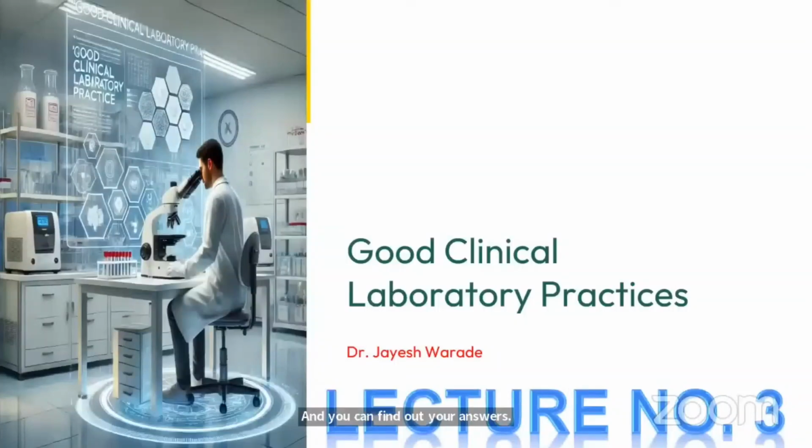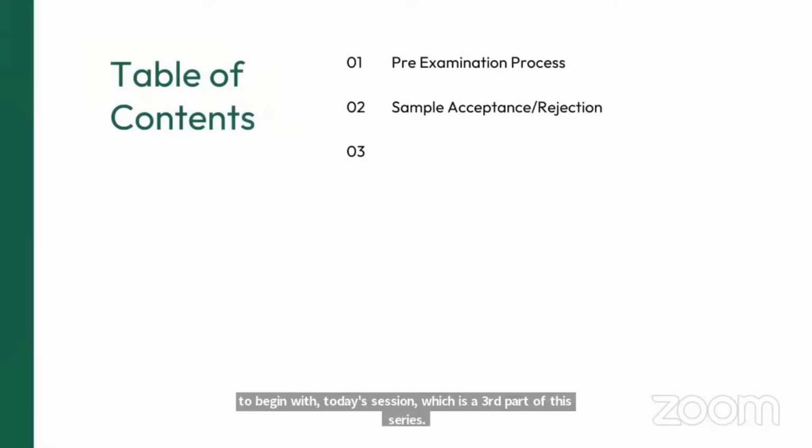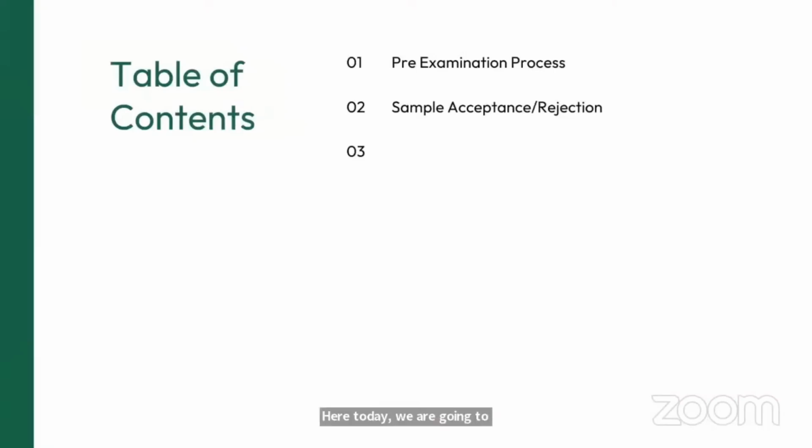To begin with today's session, which is the third part of this series, today we are going to see pre-examination processes, and the next part we are going to see today is the sample acceptance and rejection.